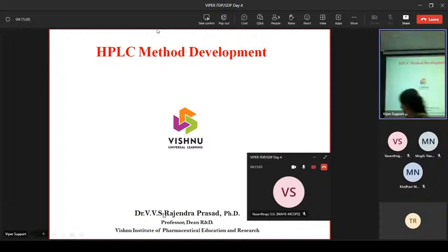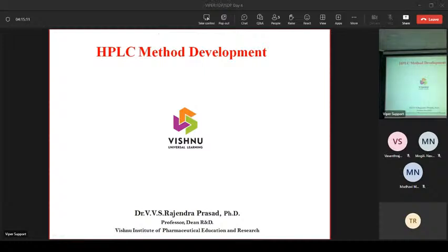Changer is slide changer. What about the remaining, or if you are there?